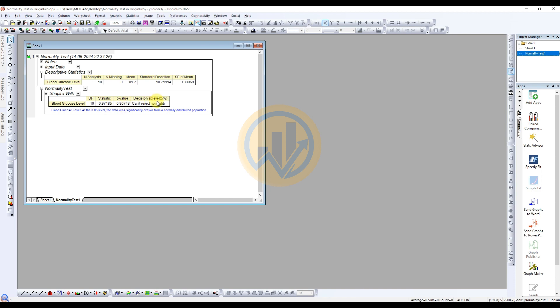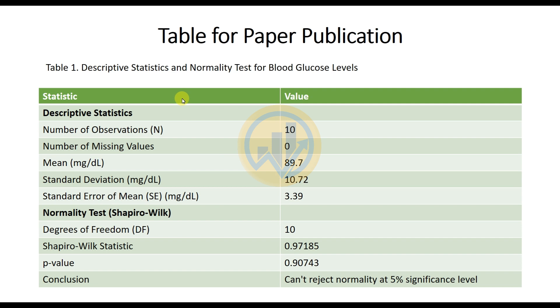At the 5% significance level, normality cannot be rejected. The blood glucose level data was statistically drawn from a normally distributed population at the 0.05 level. Now we go to the interpretation section and how to present it in a publication-format table. This is Table 1: Descriptive Statistics and Normality Test for Blood Glucose Level.